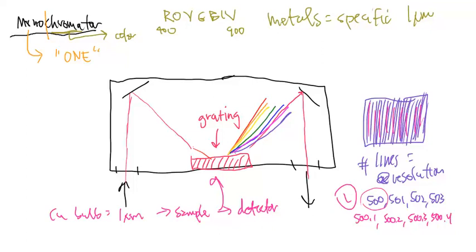You want to get rid of all of those interferences that you can. So the monochromator just makes sure that that light is indeed the specific wavelength that you have told it to measure. That's the thing with the monochromator in the AA. Okay? All right, so that's the monochromator. The grating will determine how good you can go, and it delivers the specific wavelength to the detector.